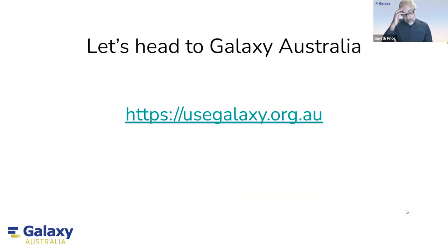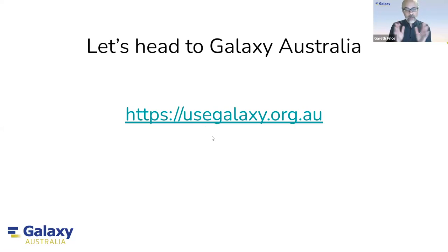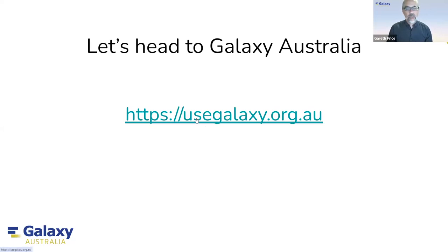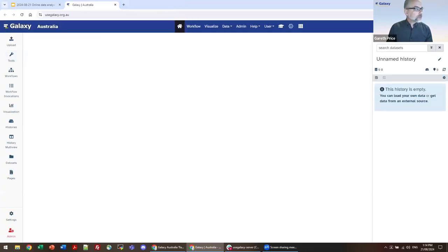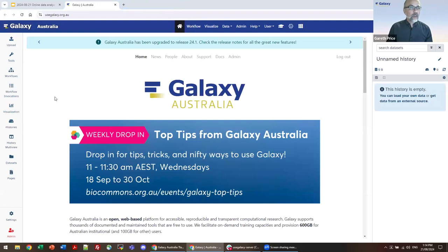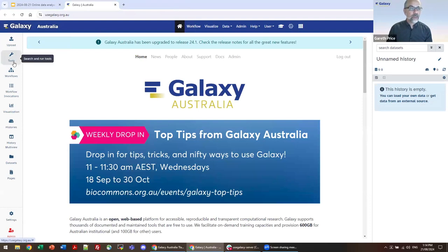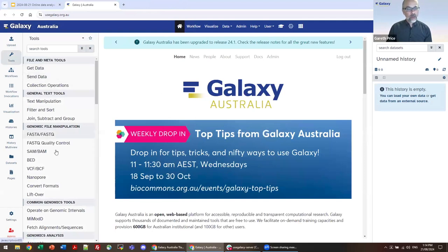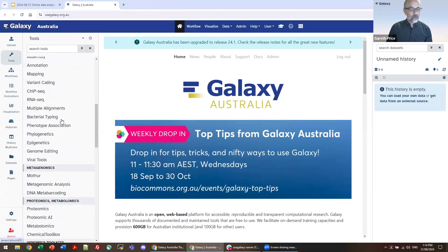With that very short preamble, because you're here to learn and not just listen, we are going to operate in Galaxy. As your trainer, I'm going to stay on this one middle screen so that hopefully everything I do you can see. Galaxy has a menu system on the left-hand side — each of these will expand to a series of options — and the one we're going to use most frequently today is exploring the tools we need in Galaxy.